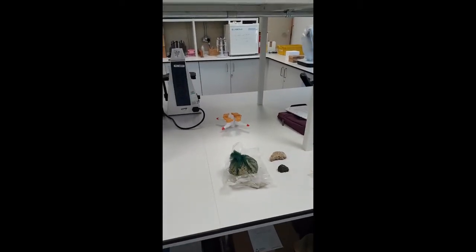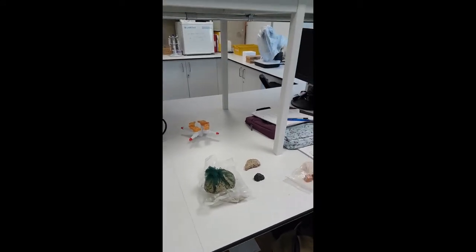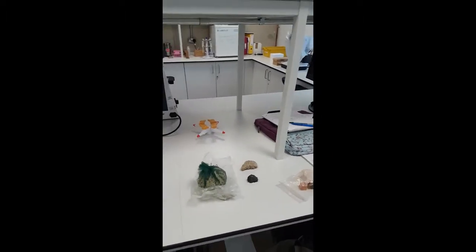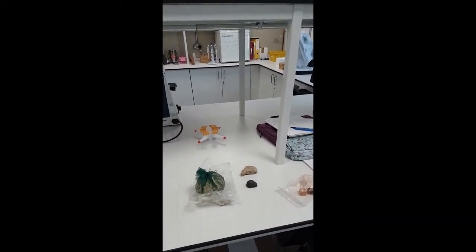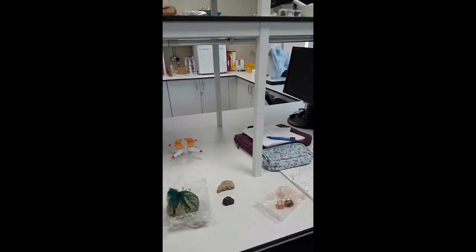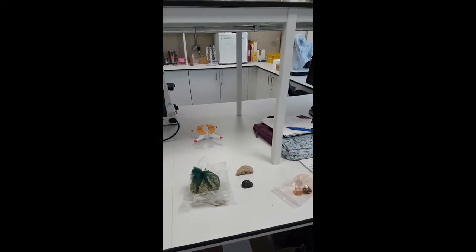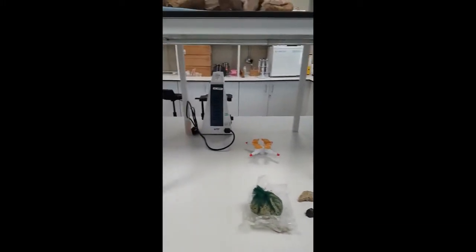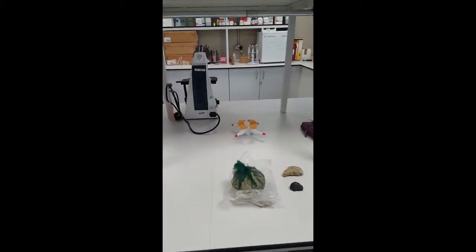Right then, now that you've been introduced to my little magnetic lab, I thought I'd quickly run through some of the stuff that you can do with it. We're essentially looking at the magnetic properties of natural systems, rocks, soils, sediments, organisms, plants, whatever that may be, and using the magnetic properties to tell us something about what's affected those systems. Looking at climate change, looking at tectonic processes, looking at pollution, looking at archaeological processes.